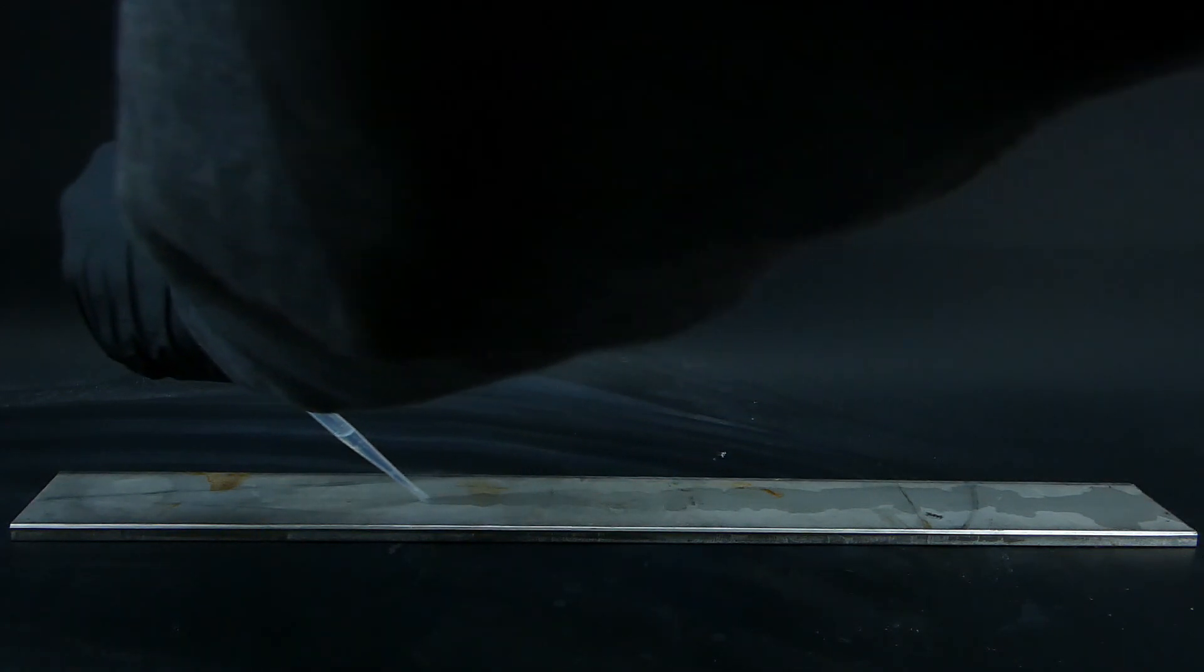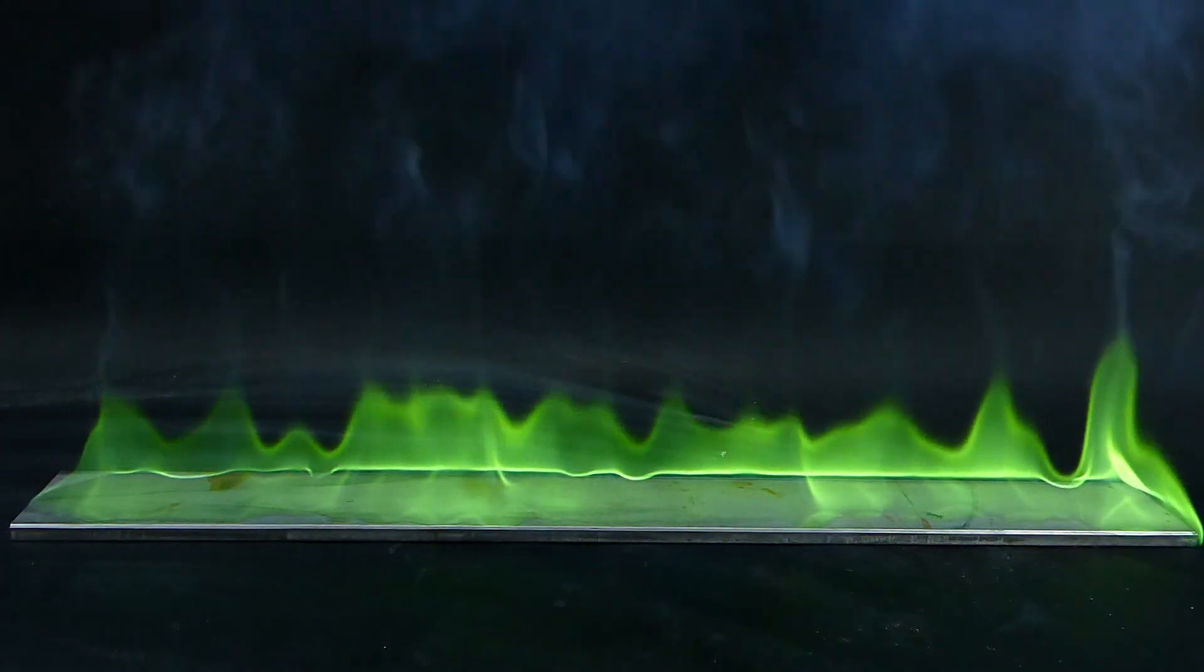For another experiment, I got a chunky piece of metal to avoid setting my fume hood on fire and poured some of the trimethyl borate on it. After igniting it, the fire quickly spread, but in slow motion, I captured a nice shot of the fire expanding.